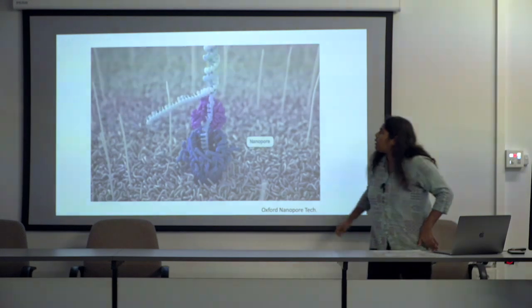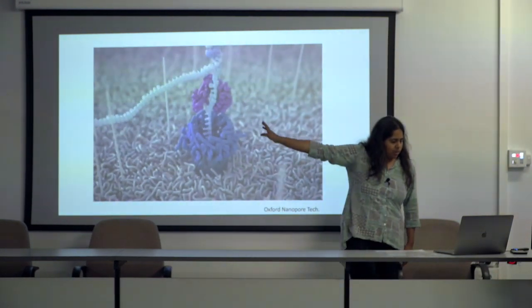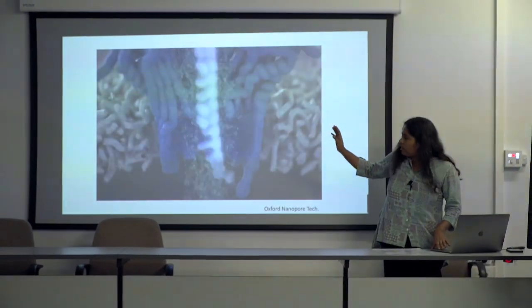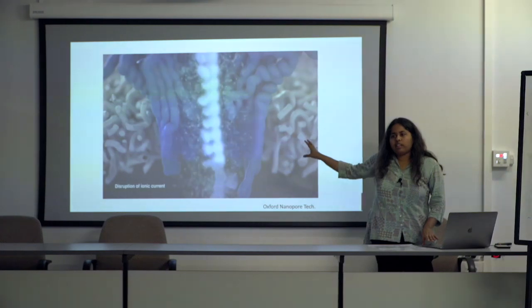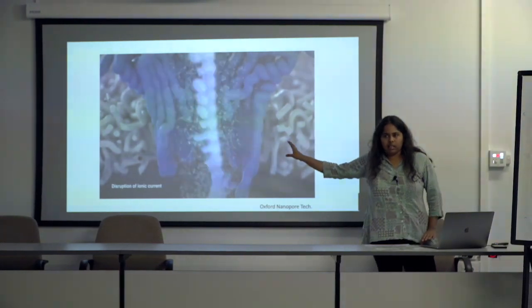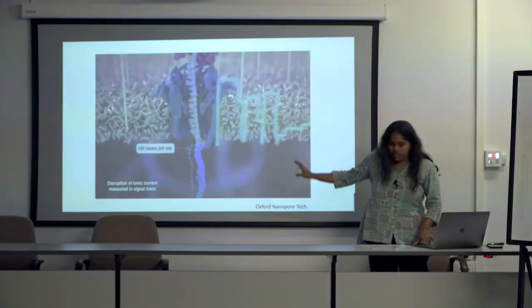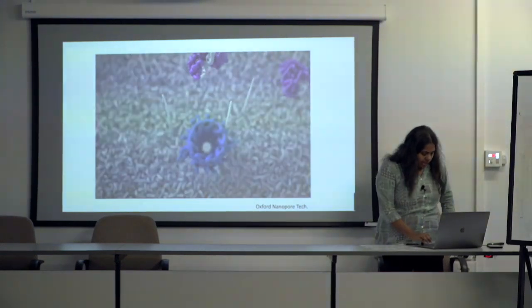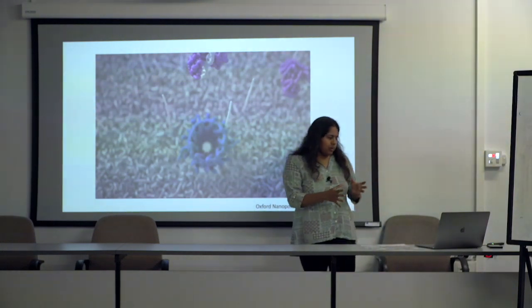And the main thing that's happening here is that your double-stranded DNA is turning into a single-stranded molecule. And what then happens is the changes in electricity are being read. And this is the raw data that was being generated yesterday from the flow cells. So this is the raw signals, and the intention is very much to go from these raw signals to your barcodes.